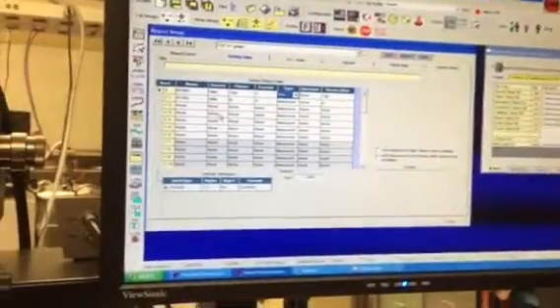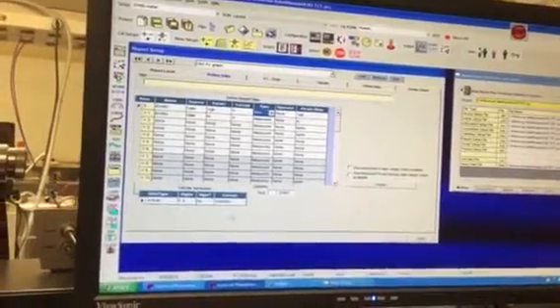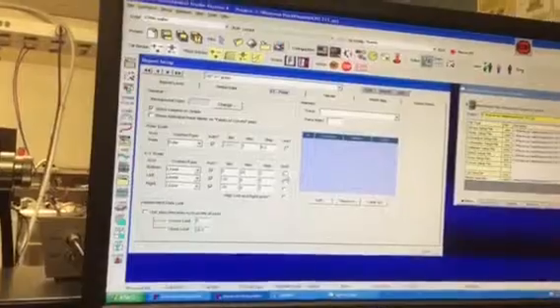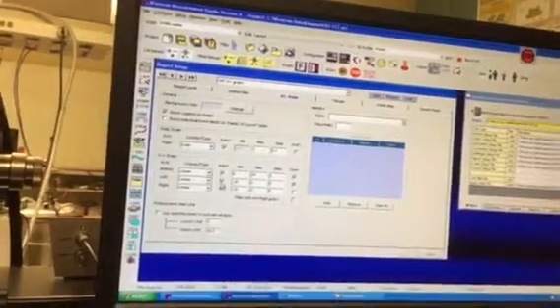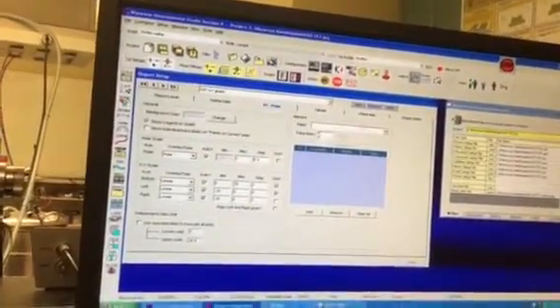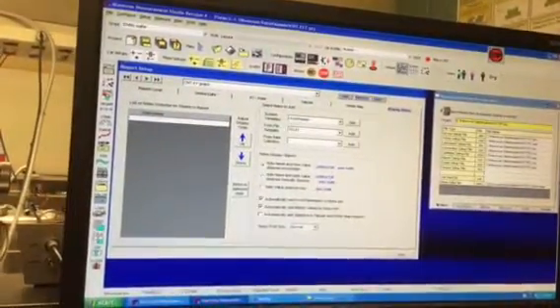Okay. And now if you want lines on the plot, you can go to the XY polar tab, and you could put grids, you could change it to log, you can do whatever makes sense. So you could just leave it like that first and just see what your plot looks like, and then come back to it. So you don't have to do any of those yet.